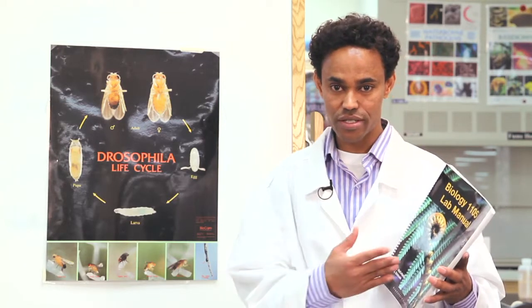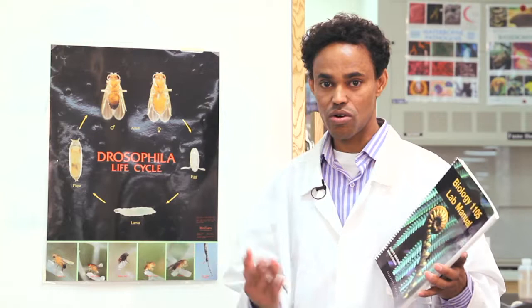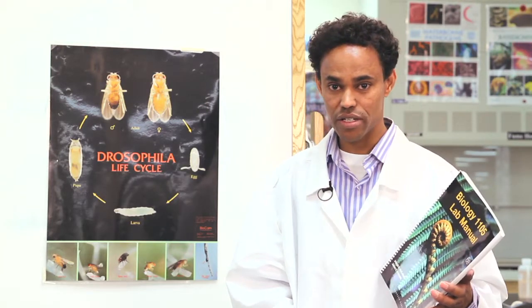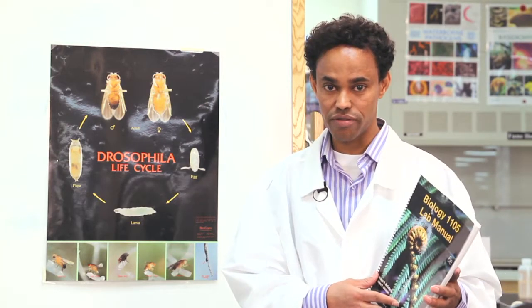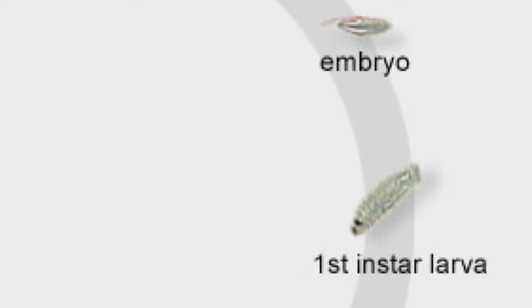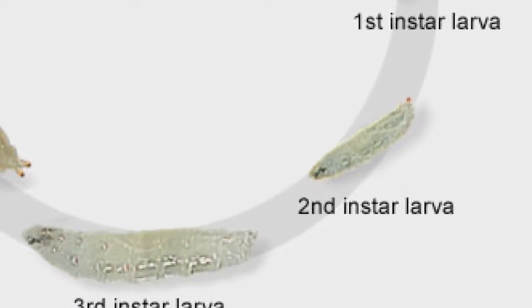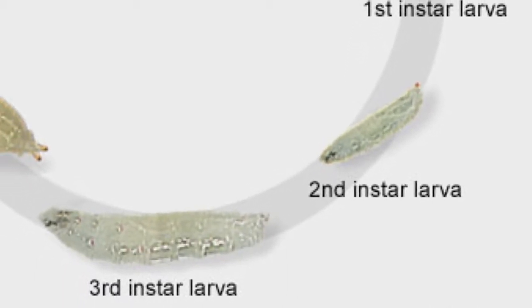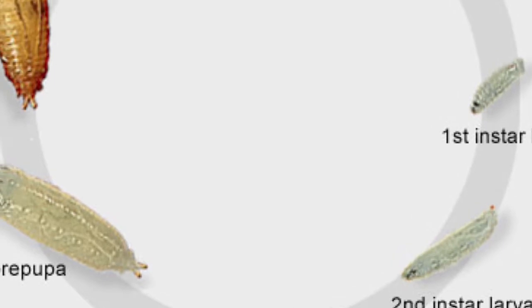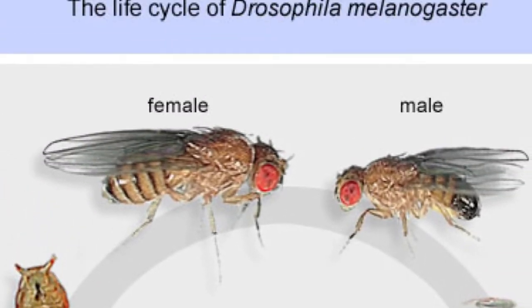Refer to the charts and the text in the lab or the internet to learn various stages of Drosophila life cycle. Eggs are laid shortly after mating and take only 1 day to hatch into larvae. Larvae go through 3 instar stages, taking approximately 2 days each. Pupae develop for approximately 6 days before hatching into the new adult fruit fly.